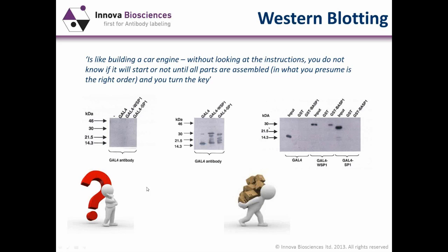And here's myself many years ago looking at these blots thinking, well, what has gone wrong? And then what transpires is I have to end up spending a lot of time and effort, and here I am burdened with all this work to try and end up with the perfect blot, and here's an intermediate. And it's based upon these experiences that I have found that what allows you to go from having a blank blot to having one which we all aim for, which is the perfect Western blot, is to put in place a fundamental checklist for yourselves to go through to assist in the troubleshooting process.